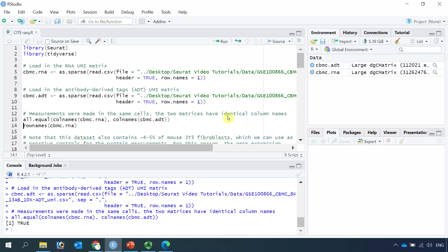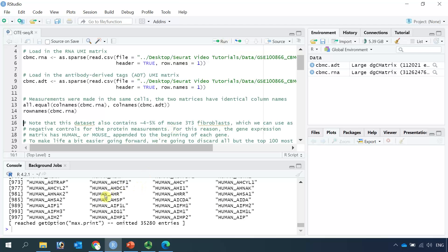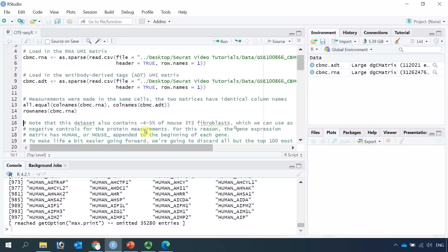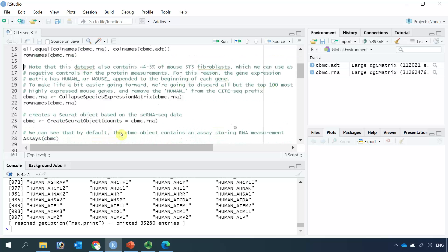So we know both datasets have identical column names. Now we can have a look at the row names for the RNA dataset. You can see the row names are gene names. You can see all the genes have a human-hyphen prefix attached. This is because when they produced the dataset, they included about 4-5% mouse NIH 3T3 fibroblasts as a negative control for protein measurement. In the original tutorial, they recommend keeping just the top 100 mouse genes and removing the human-tag prefix.